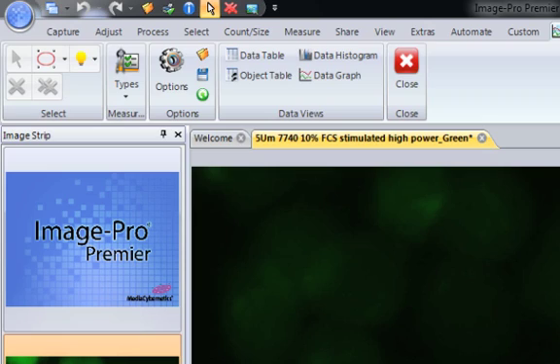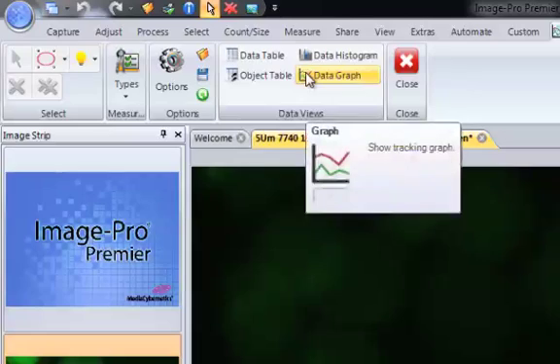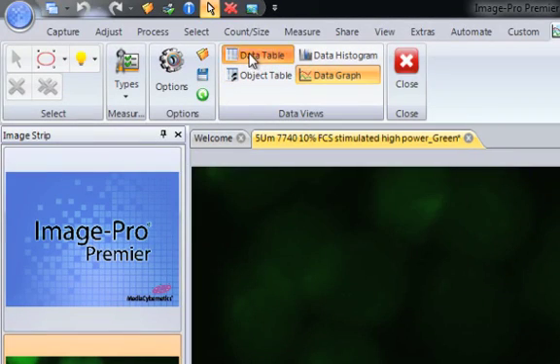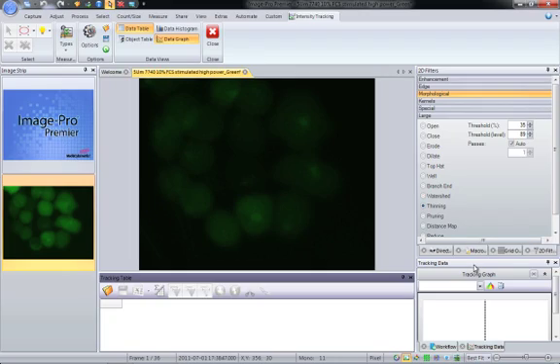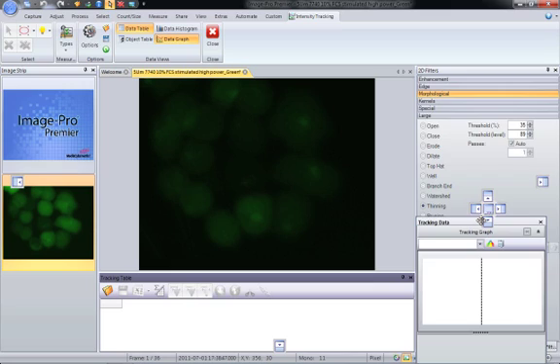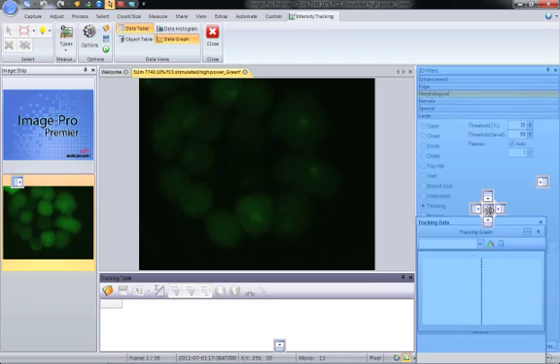Doing an intensity track is really easy, in fact I can show you the results live, so on the right here I can select the data graph, and then the data table, let me just rearrange this so it is a little bit easier to see.